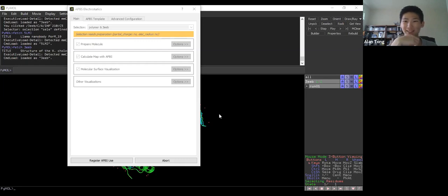Oh, so Leo has another one. Awesome, 4W2Q. I'll go to that one after this runs. Hopefully, this might take a while, right? Computation takes a long time. But it's calculating the forces, it's calculating the energy of a proton as it's rolling around the surface of the molecule. So imagine taking a proton and rolling it around the molecule to calculate its energy, and it's loading.